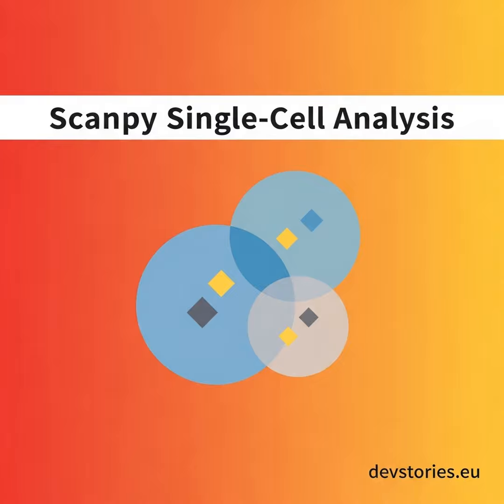Scanpy offers different statistical methods to do this math, called flavors. The traditional Seurat flavor expects your data to be log normalized first. It calculates dispersion, bins the data, and standardizes the values. There's also a newer Seurat v3 flavor, which explicitly requires raw, unlogged count data to properly model the variance. Alternatively, the Cell Ranger flavor uses a slightly different approach to calculate normalized dispersion based on the counts. The flavor you choose simply dictates the specific statistical distribution used to model that relationship between the mean and the variance.